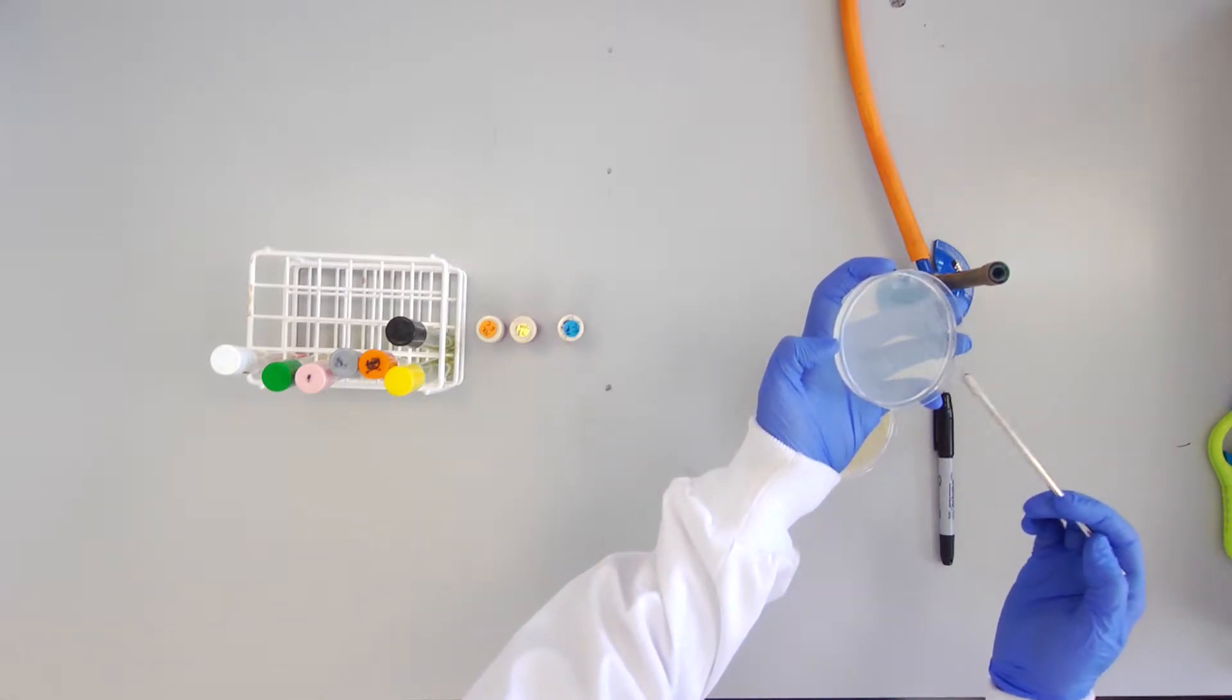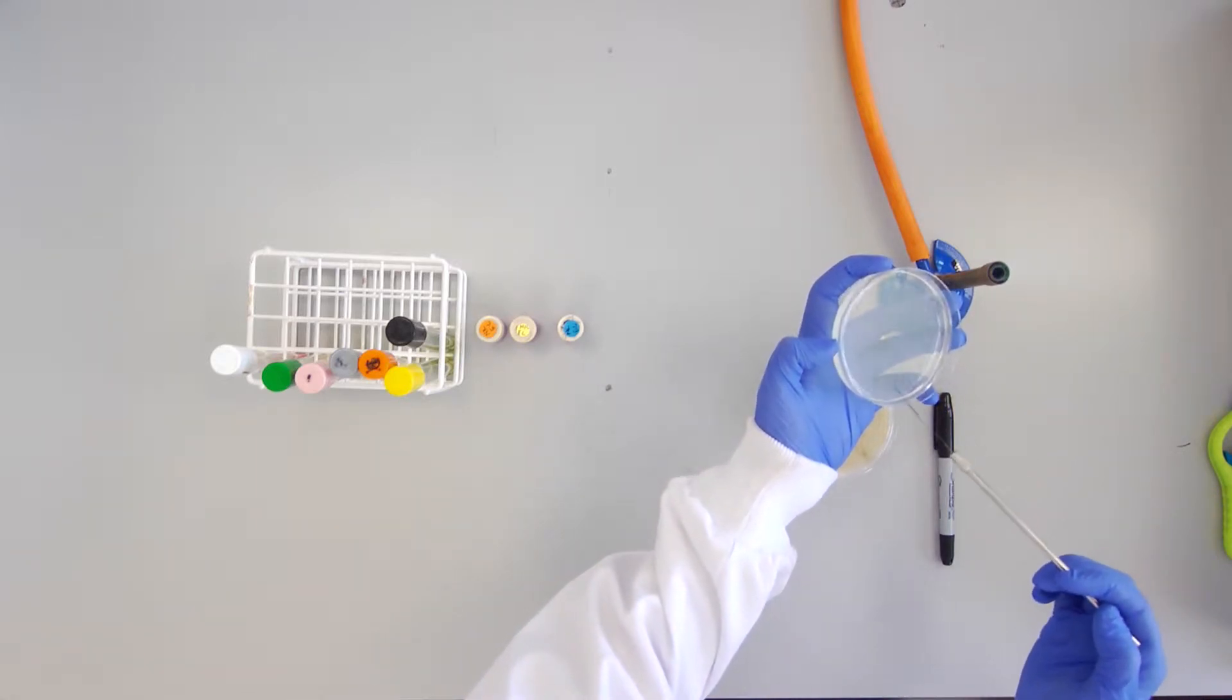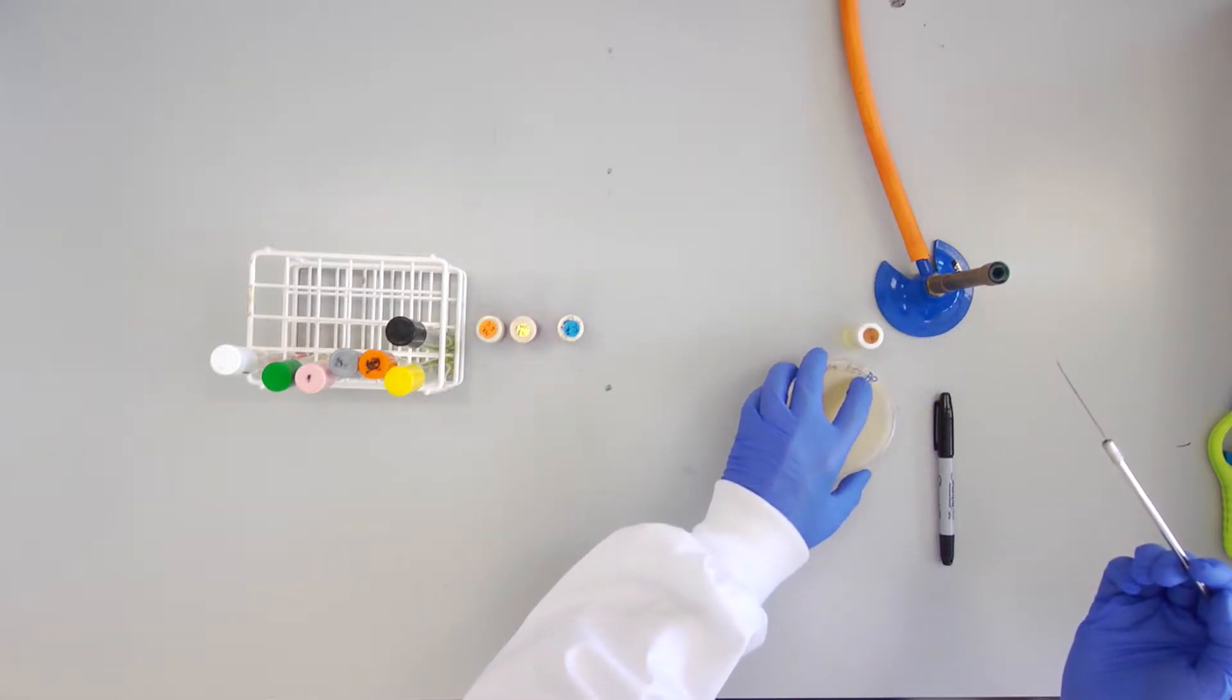Make a single zigzag streak with your bacteria on the phenolphthalein plate which is labelled PP.